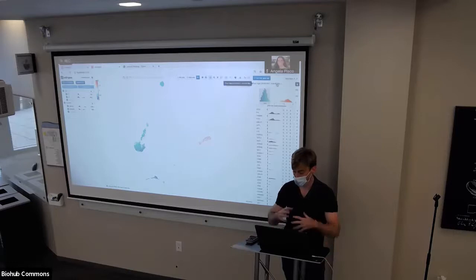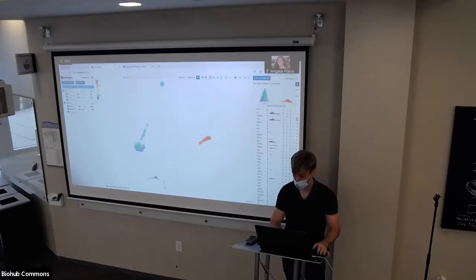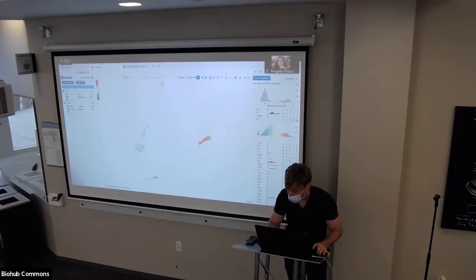Here, this is actually a collection of genes. All these genes are combined together to make an average distribution. But we can also select individual genes and color by individual genes. So here we can click the droplet next to FTH1 that pops up here. And then we can click these arrows to expand it. And then we can brush this histogram as well.